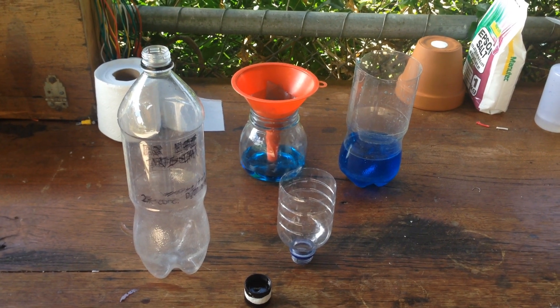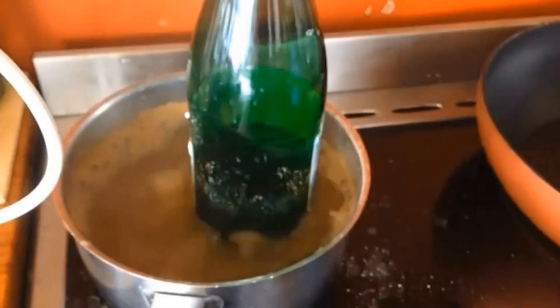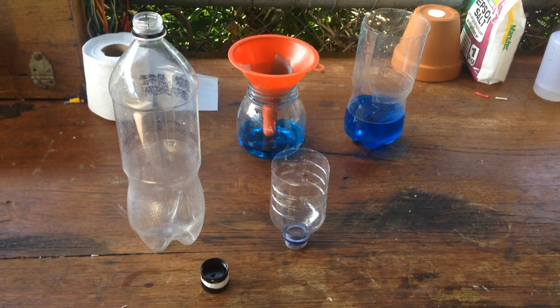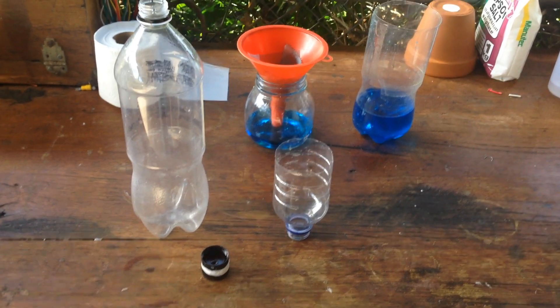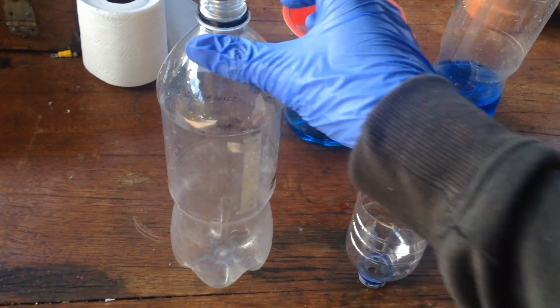Hi guys, Harry here. Welcome to Scrap Science. So today I just thought I'd show you a nice quick video on this setup that I've come up with for a vacuum filtration.